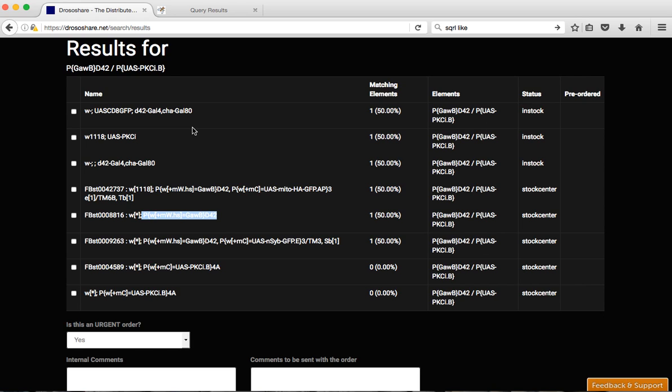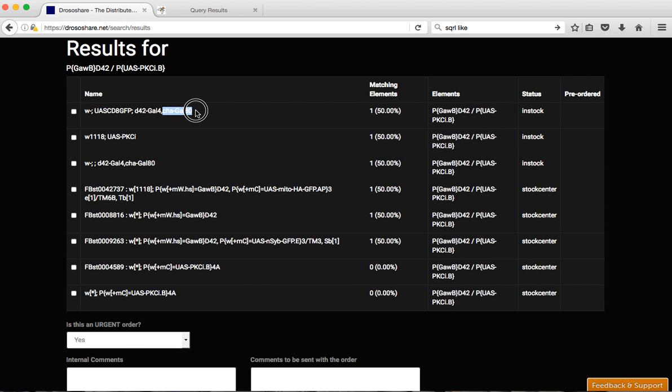So now you see that we don't have any D42-UAS-PKCi line. We'll have to order each one separately. And also see that in this lab here we also have D42-Gal4 together with cha-Gal80 element, which will restrict the expression of the Gal4 to non-cholinergic neurons, which may be interesting. So if you want that one you could just pre-order this one, which doesn't have the GFP.